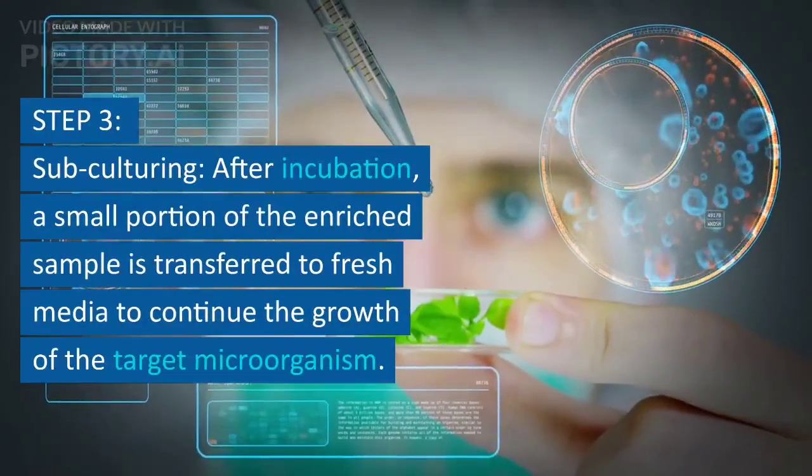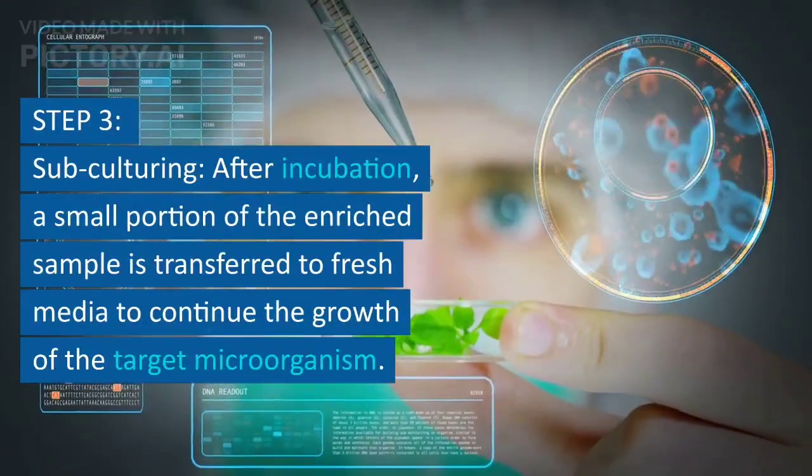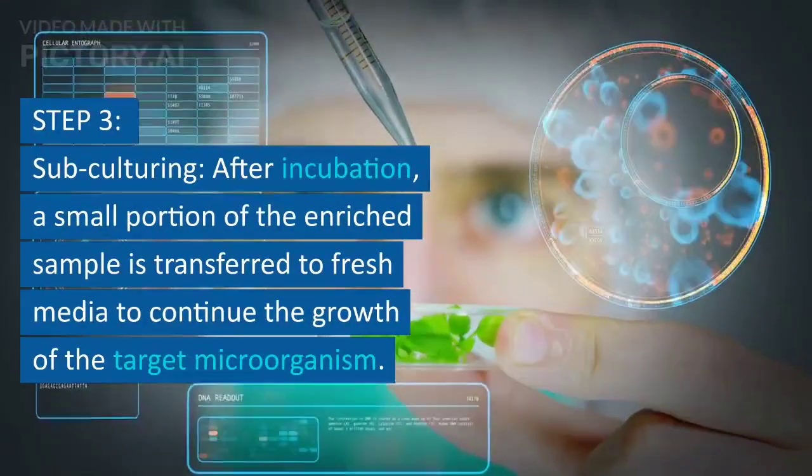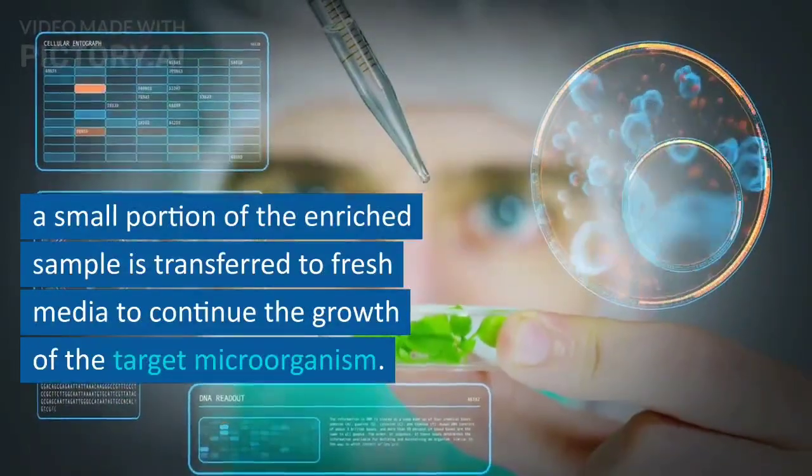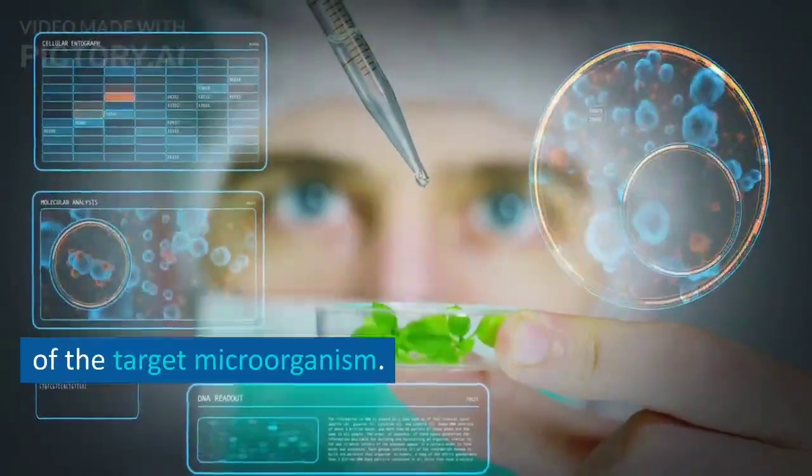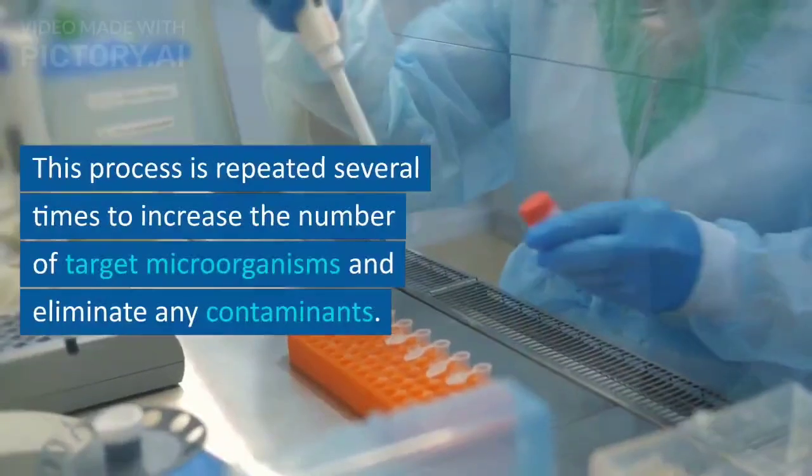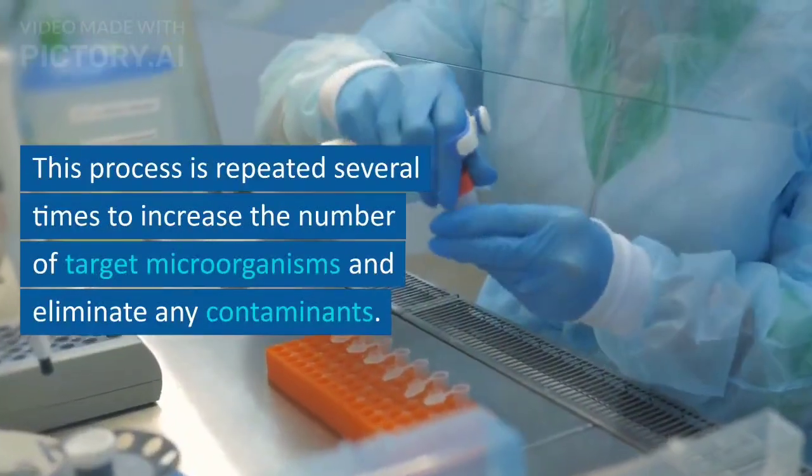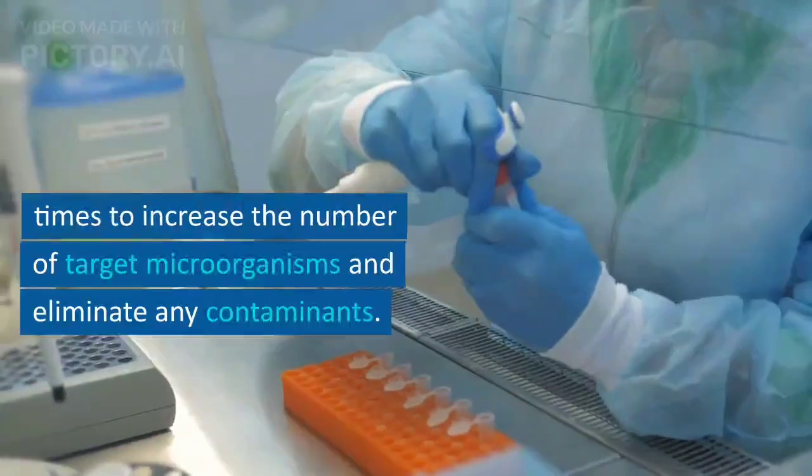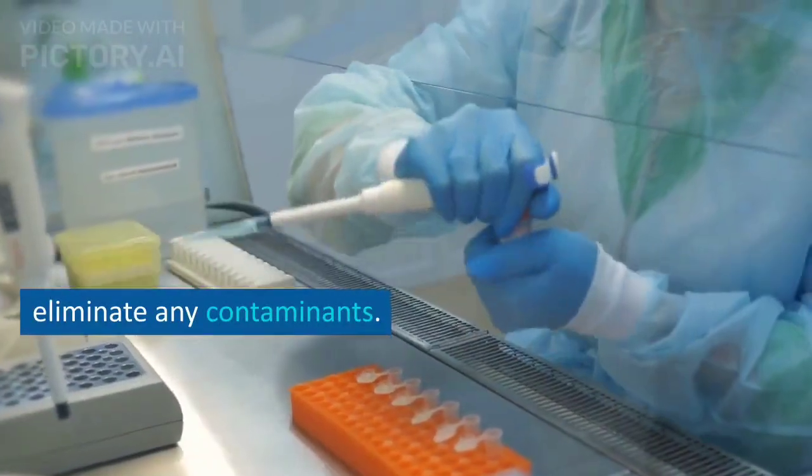Step 3, Subculturing. After incubation, a small portion of the enriched sample is transferred to fresh media to continue the growth of the target microorganism. This process is repeated several times to increase the number of target microorganisms and eliminate any contaminants.